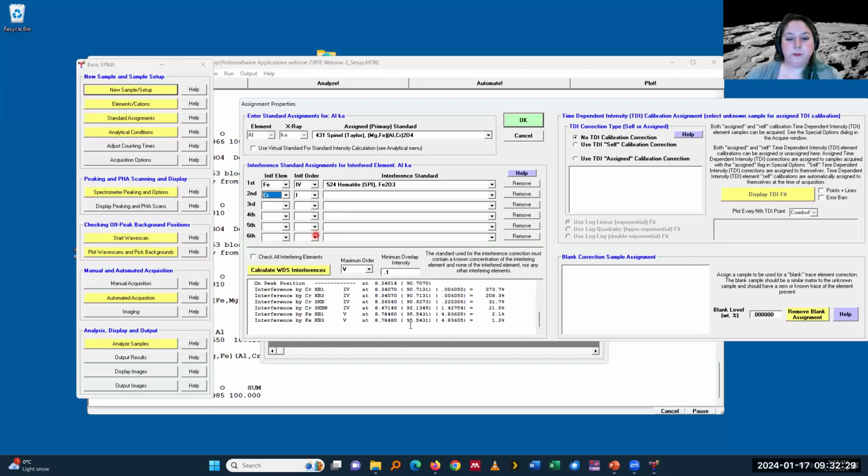defined in here. It gives me some idea how bad, how good they are. Again, the best is always to do a wave scan to really see how realistic it is. The higher the order, the lower the number, the less you have to worry about that.